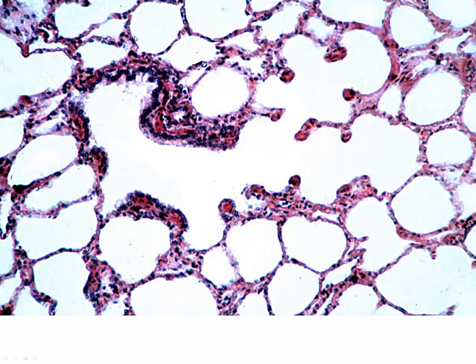However, when we get close to the end of our conducting pathway, we can recognize, again, the structures of the bronchiole, spiraling smooth muscle, intact mucosa. But then we get to a point where we begin to see the interruptions of the mucosa as we lead into alveoli. Here we can clearly see one of those interruptions. So when we begin to see alveoli coming off of this pathway, then we know that this is the beginning of a respiratory bronchiole. If this then is the beginning of the respiratory bronchiole, then further upstream where we have intact mucosal lining is a terminal bronchiole.